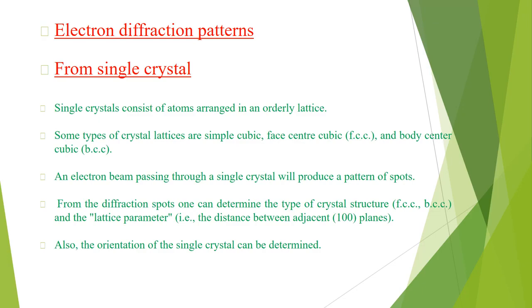Also, the orientation of the single crystal can be determined by using the electron diffraction pattern.